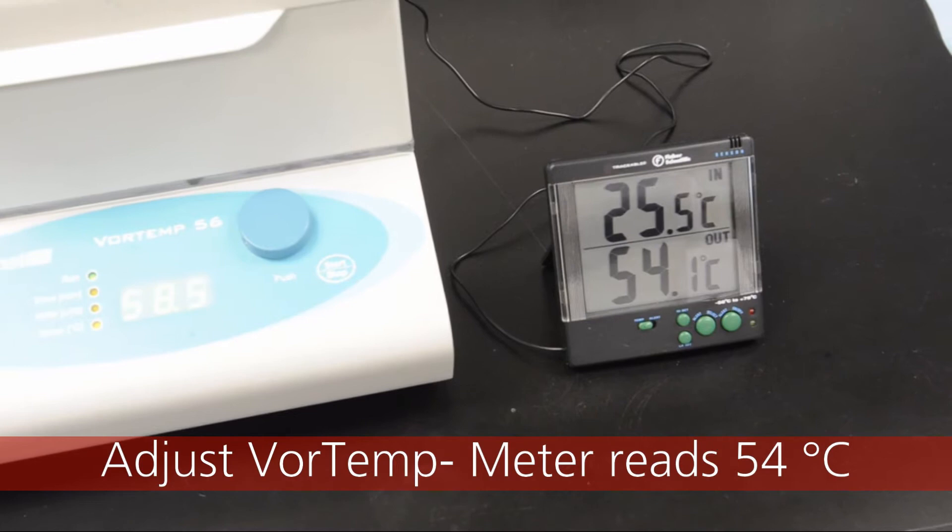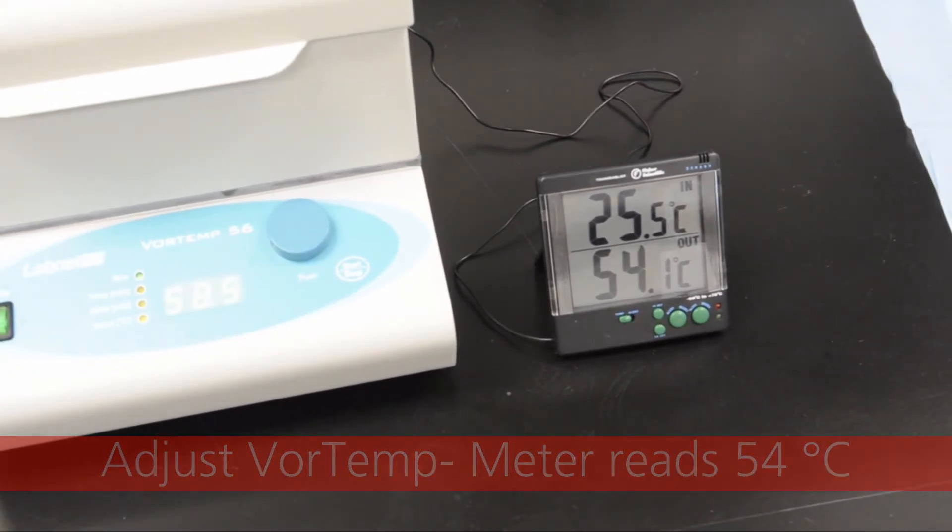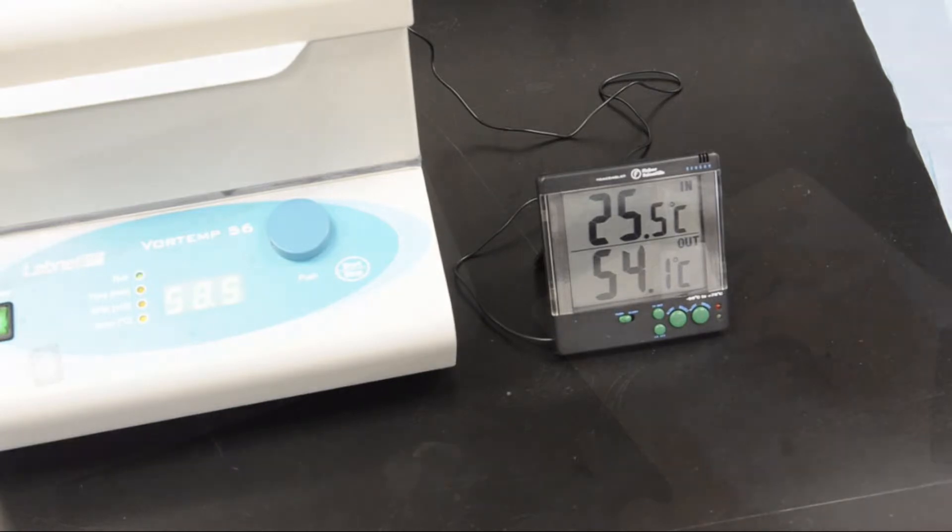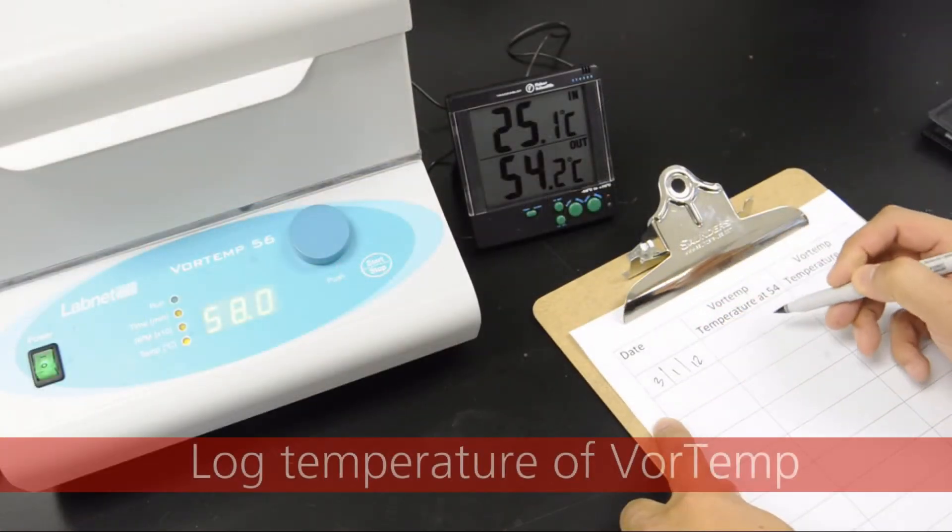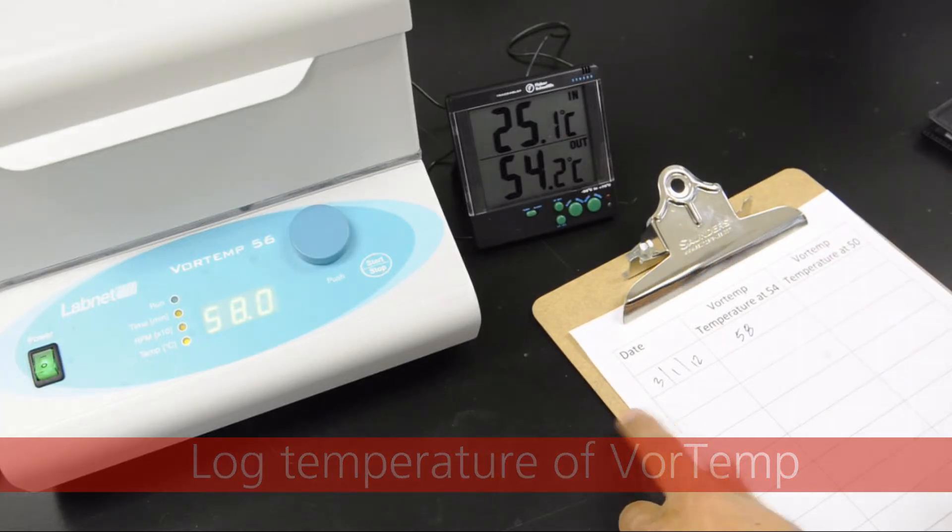adjust the Vortemp temperature until the reading on the digital temperature meter has reached 54 degrees C and the reading is stable. Once this has occurred, log the temperature displayed on the Vortemp and on the digital temperature meter.